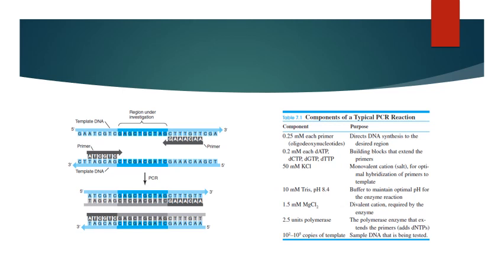Now, by far, contamination is the bane of all PCR methods, and contamination is going to be controlled both physically and chemically in your PCR lab. Physically, the best way to avoid PCR carryover is to separate the pre-PCR areas from the post-PCR analysis areas. You need to have positive airflow, airlocks. In other words, engineering measures have to be taken, extensive measures, in particular in high throughput laboratories that process a large number of these samples.